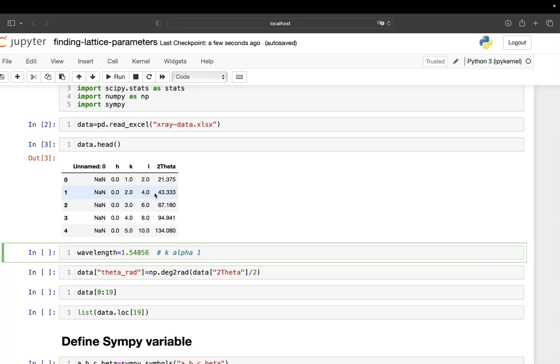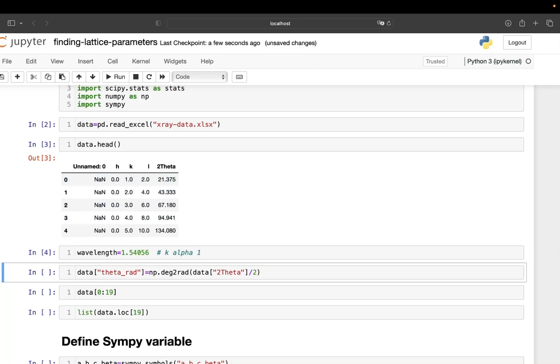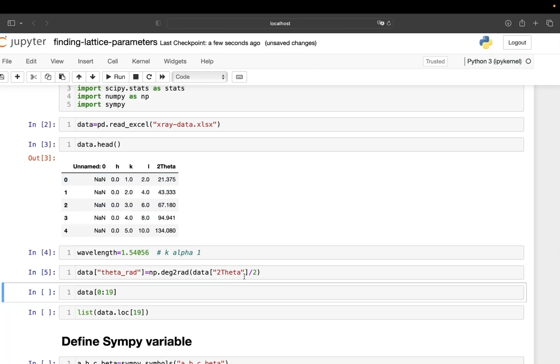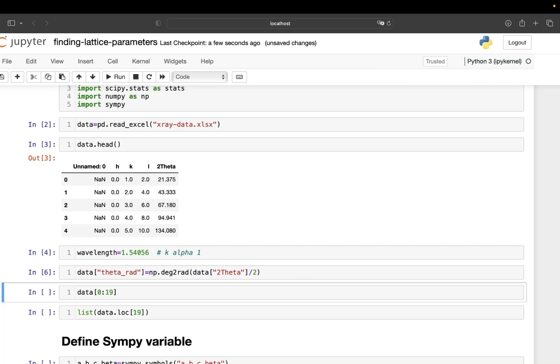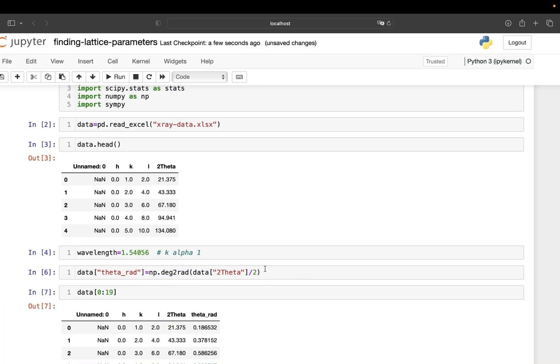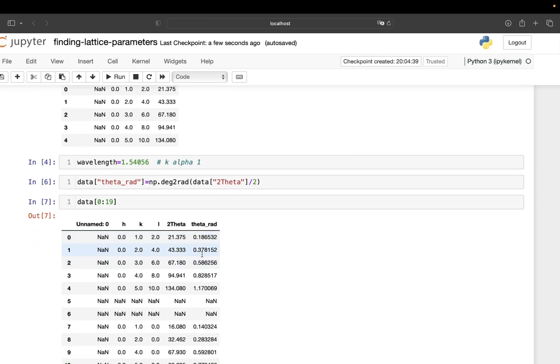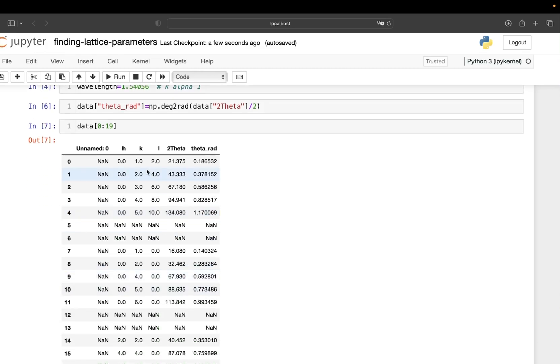In this program I need all the angles in radians. I have 2θ here, and by running this cell I can convert everything to radians. You can see there is a new column where all the angles are now in radians.